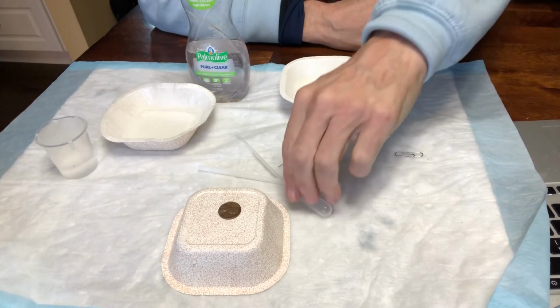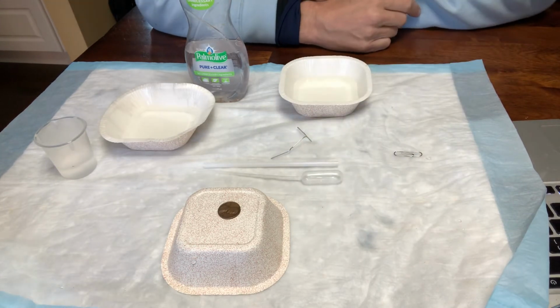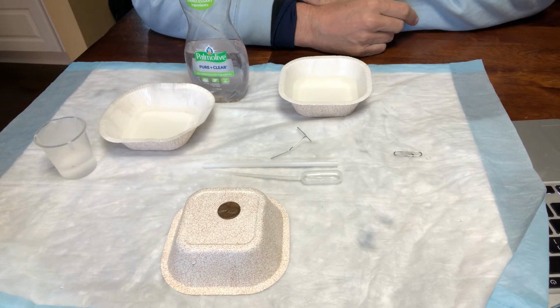We're going to do a water lab this week, and I'll give you the instructions on paper, but also wanted to show you just how it works. We changed the lab a little bit so that you can do it at home for your remote learners.